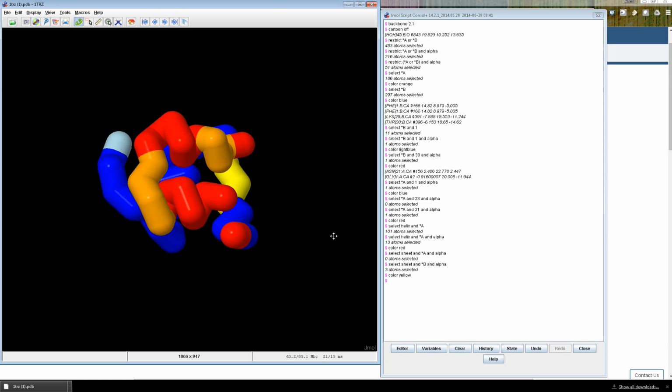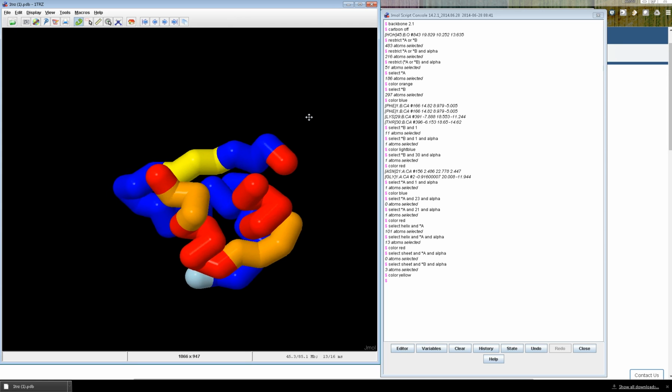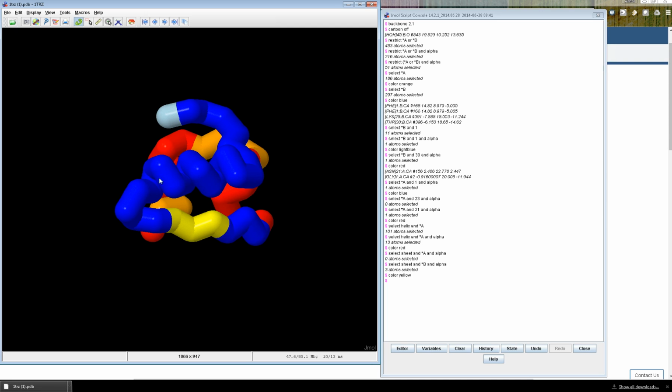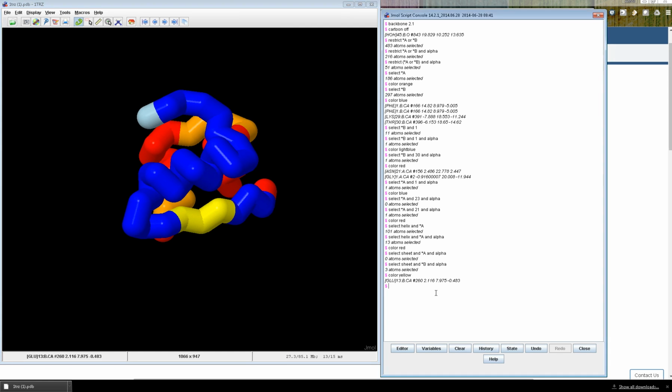So we've got our secondary structures here, but we need to highlight some things. And we could also, you can color this alpha helix. Actually, yes, I want you to color this alpha helix red on the B chain. So I'm expecting to see that in your file. But we need to highlight some of the side chains here. And so I'm going to write out the list here that you should have. Now, this is something that you will have to do some research on, and I will provide you some resources to help you with this.